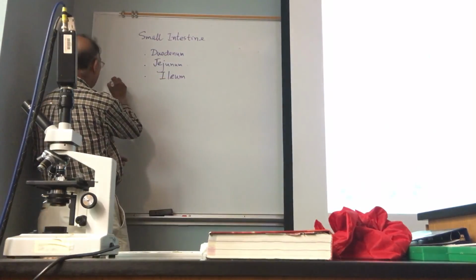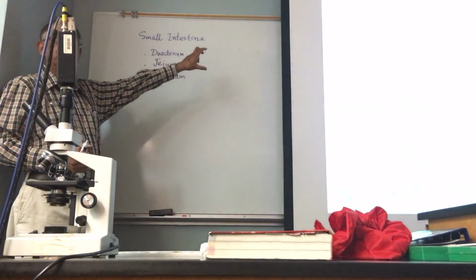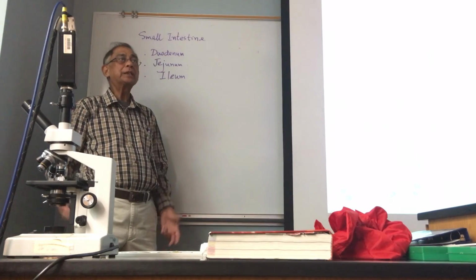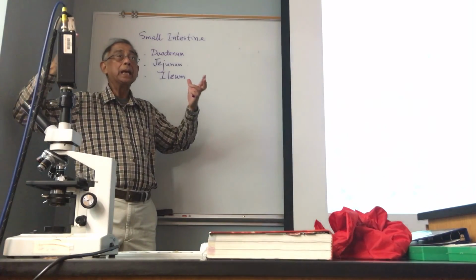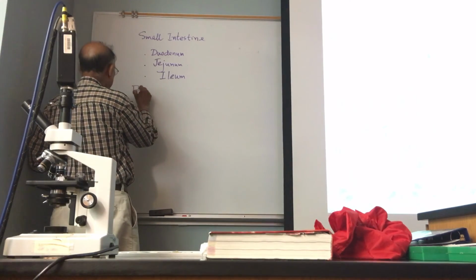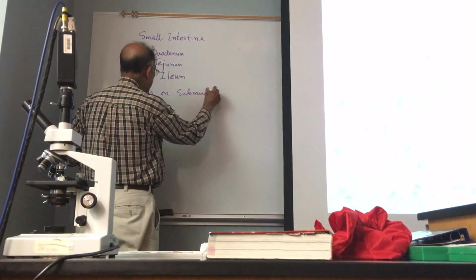All right, now, to differentiate these 3 different anatomical parts, though they form these parts of small intestine, they can be distinguished histologically by focusing on a particular feature, that is the submucosa. You get that? So what you have to focus on is the submucosa.